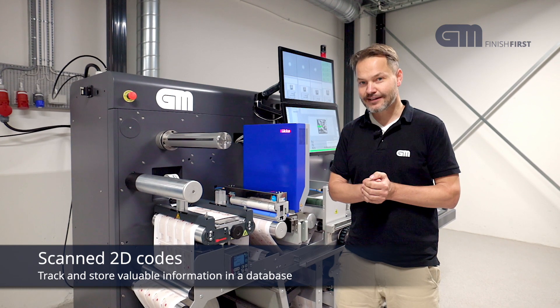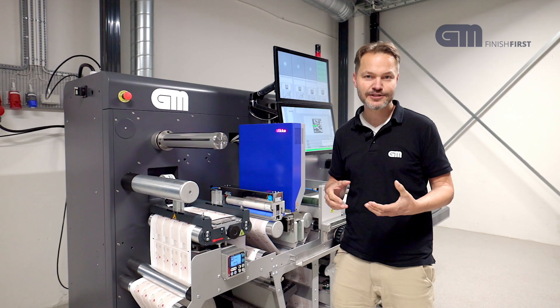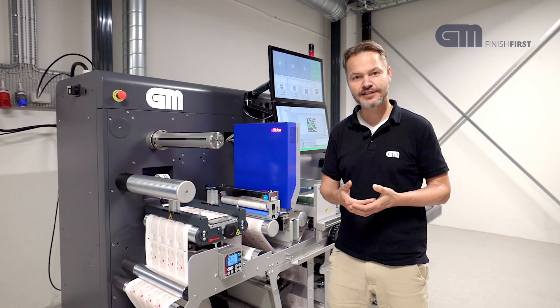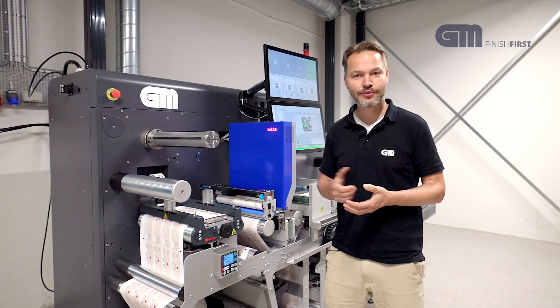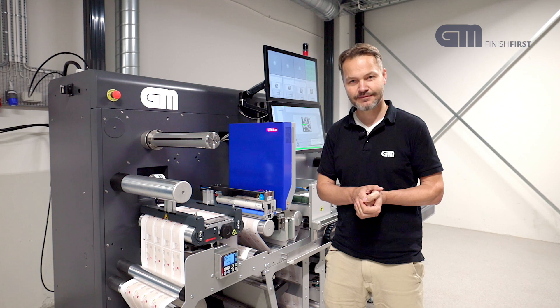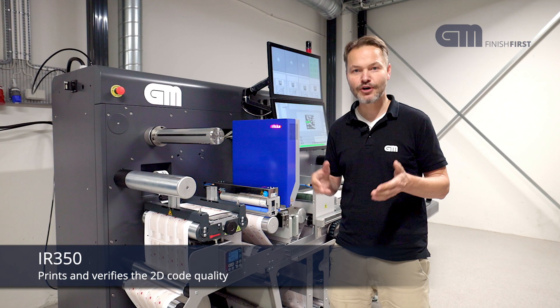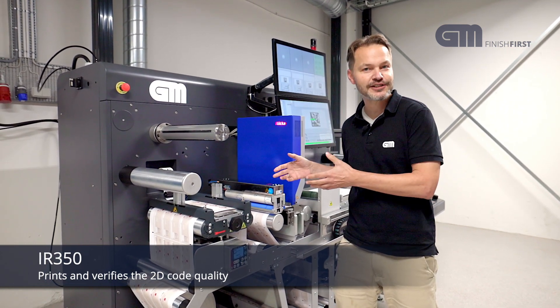To do all that, we have developed the GM IR 350. It is our classical inspection rewinder, but this time it has a special high-resolution inkjet system and a camera system with some unique features fitted. This system can both print the actual QR code, but most importantly, it can verify it. And this is the whole reason for this machine.